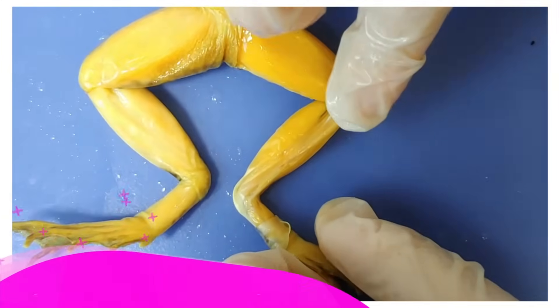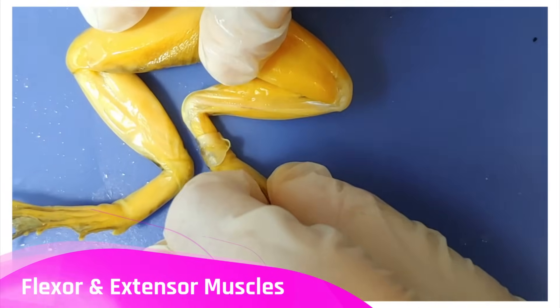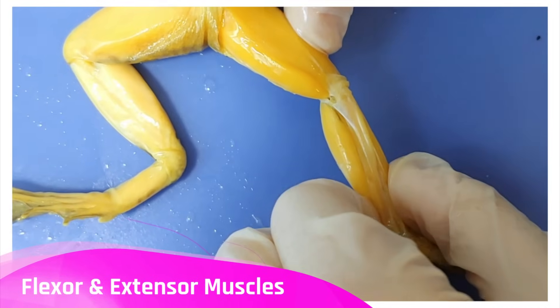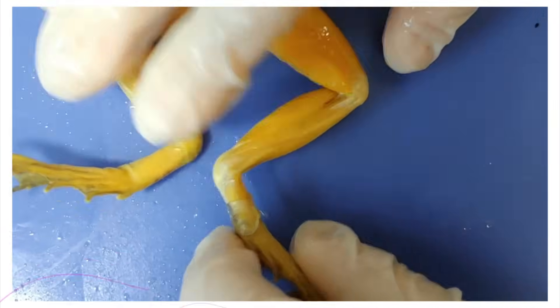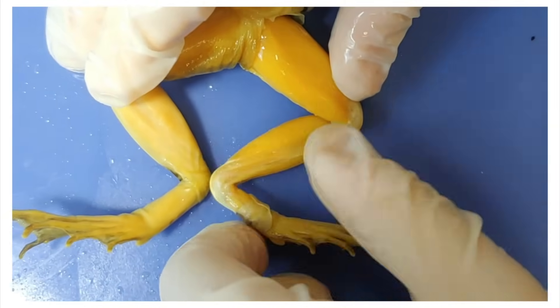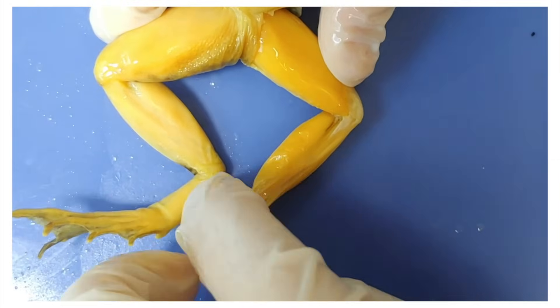Here's the flexor muscle for this joint, which makes it flex, and the extensor muscle, which makes it extend. Here's another joint — there's the flexor muscle making the joint flex, and the extensor muscle making the joint extend.